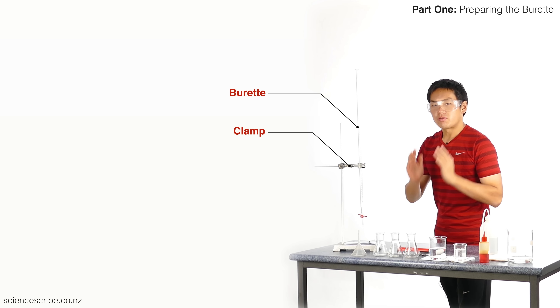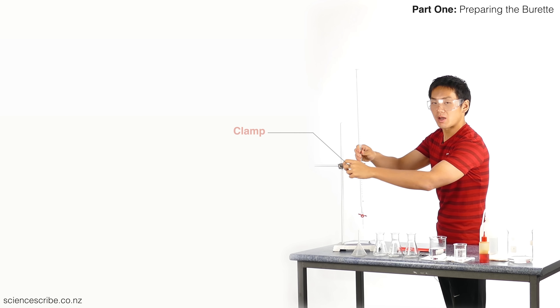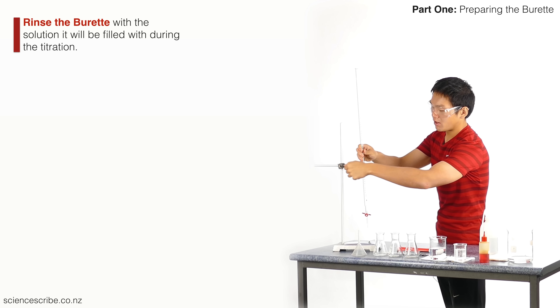You must always clean your burette with whatever solution you're going to fill it with. In this case, I'm going to fill my burette with hydrochloric acid during this titration, so that's exactly what I'm going to clean it with.